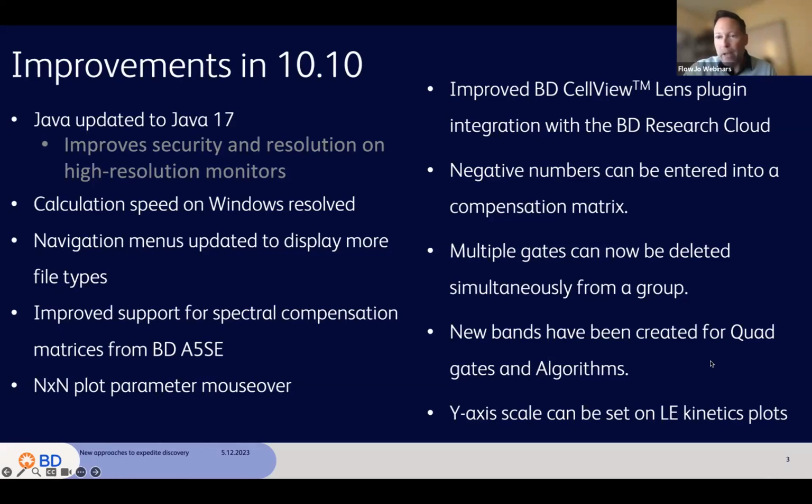So lots and lots of stuff. There's a bunch more stuff that is even below the level of this that is fixed and works a little bit better. Won't demo this, but there it is on the screen so you can see what should be working better, faster, stronger, or whatever the rest of the Daft Punk song lyrics are.